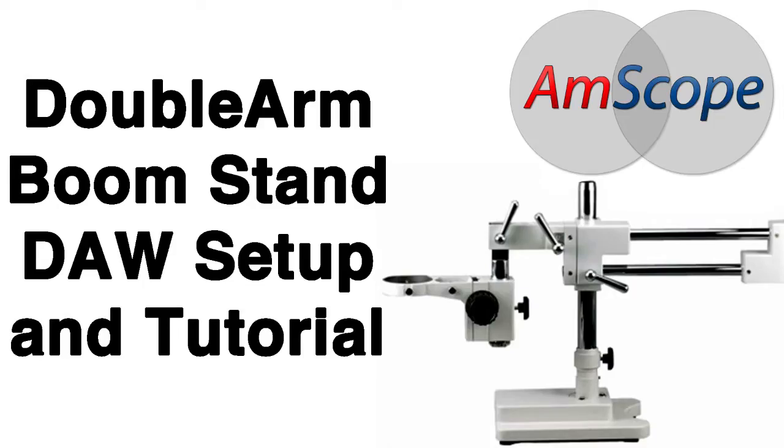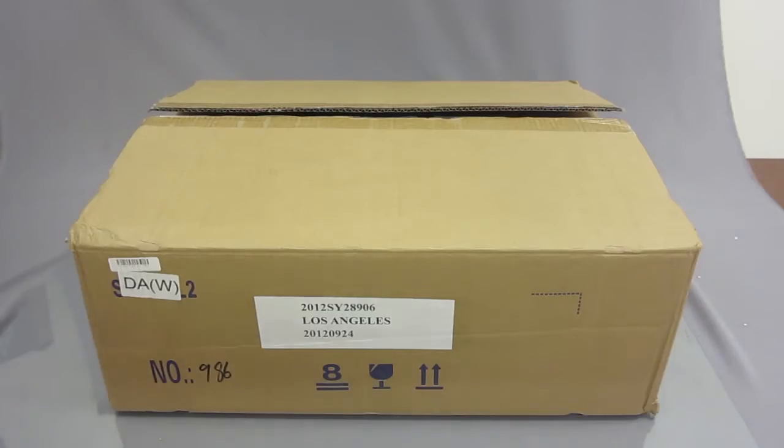Hey, what's up guys. This video is going to be an unboxing and setup tutorial of the double arm heavy-duty boom stand, model DAW. First things first, you want to make sure that you open it facing up.